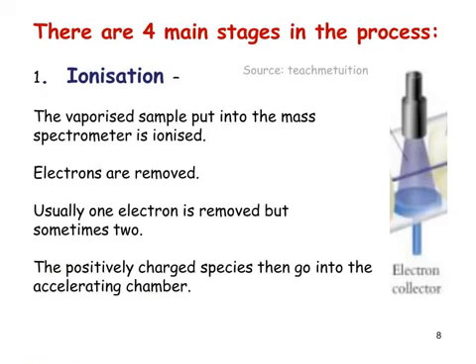So let's take a look then at some of these aspects in detail. There are four main stages in the process. And I would emphasize you don't need to know the details of these, but it's worth spending 20 minutes going through the basic operation of a mass spectrometer.